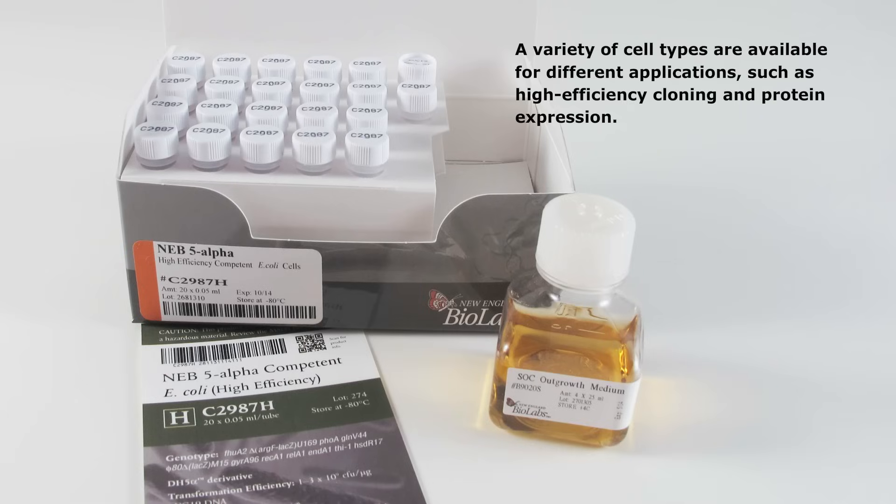A variety of competent E. coli types are available in different formats and for different applications, such as high-efficiency cloning and protein expression.